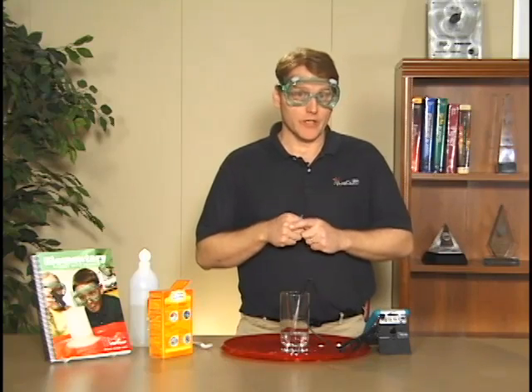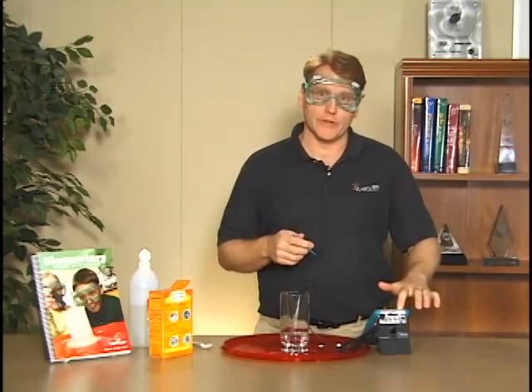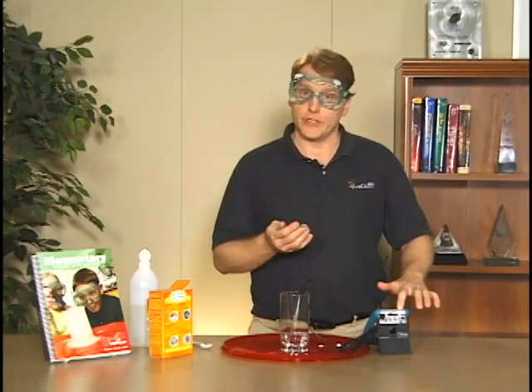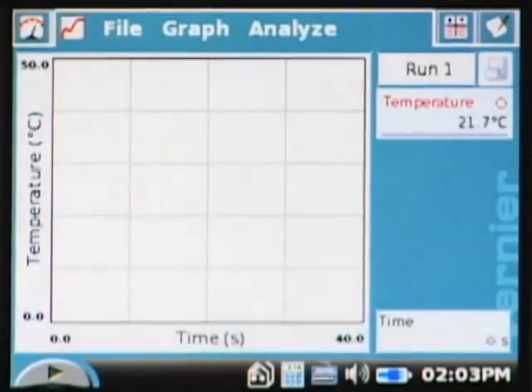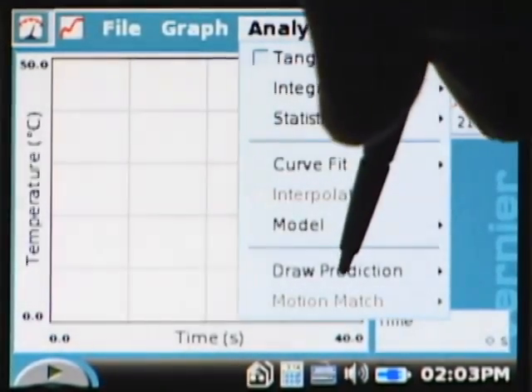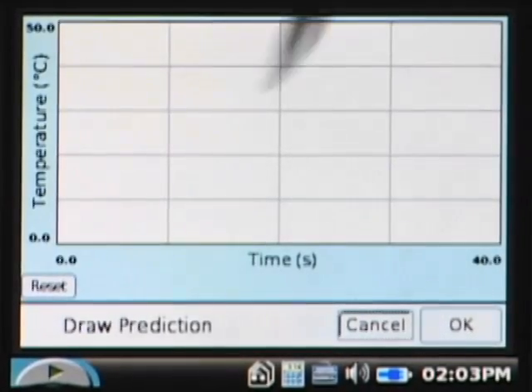Before I start, I want to think about this for a second. Maybe I want to draw a prediction - a lot of labs have you do predictions, and the lab quest unit has the ability to do a prediction on board. I can tap on my graph view, and it's under analyze, so I can come down to draw prediction.